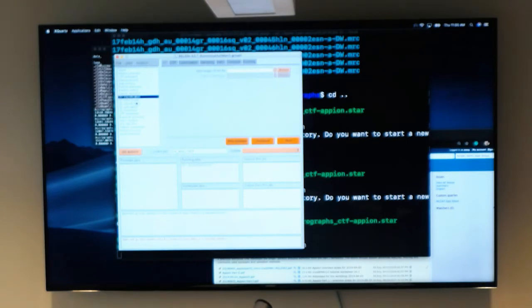And skip the initial model, and you can decide if you want to do 3D classification or 3D auto refine, right? But at minimum, what I want you to try to do is 2D classification and some parts of 3D, whether it's 3D classification or 3D refinement. If you have additional time, you can try certain things.